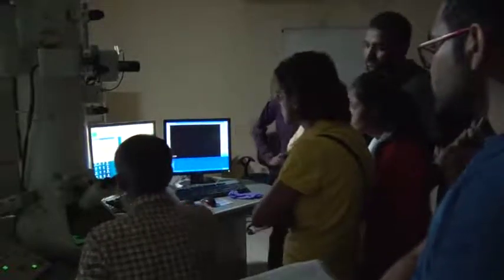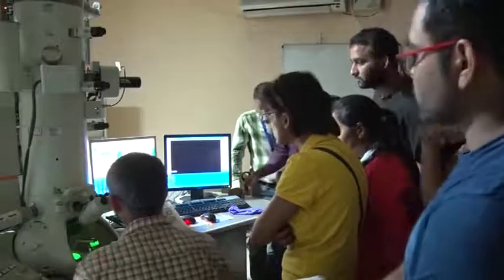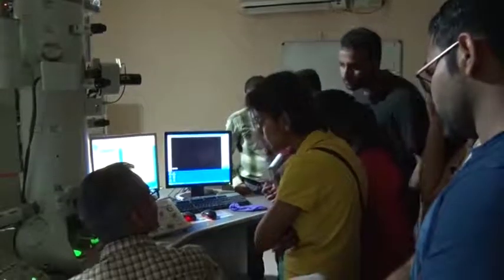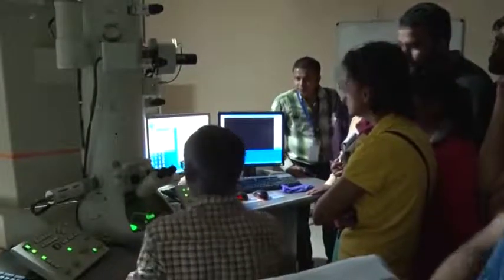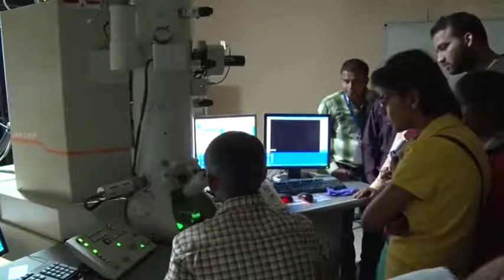I have just aligned the microscope, so I had been at 100K and did the final stage, but now we will reduce the magnification to something like 30K. And how to move the sample? The movement of the sample is done by this joystick. So you can see the sample there. Now I can still see the sample reasonably, isn't it?